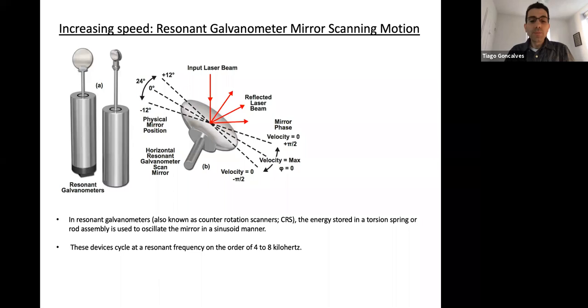These are used in any system that needs to go fast. So for calcium imaging, these are usually the preferred modes. The problem is that because you can't really adjust the speed, sometimes you run into problems with your pixel dwell time, meaning you collect too few photons because you're going so fast that you don't illuminate a single point for long enough to collect enough photons.